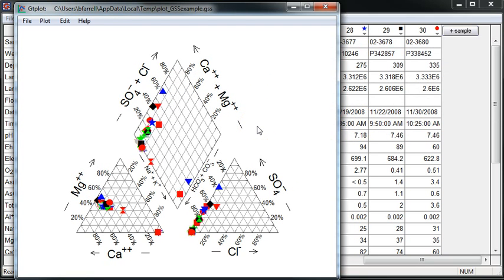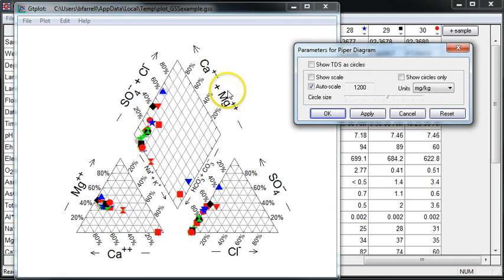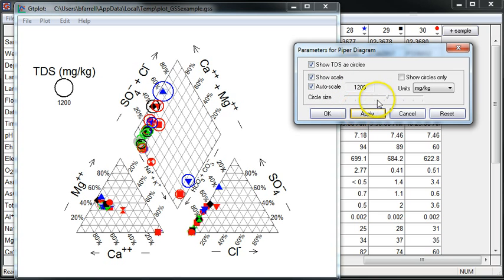I can represent TDS — the total dissolved solids — for each of my samples with circles of varying radii. To do that, I'll right-click on the symbol and choose Configure Plot. I'll check Show TDS as Circles, and now I might add a scale bar and get rid of the symbols themselves, only considering the TDS circle.